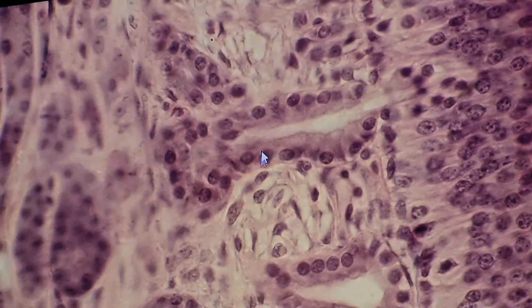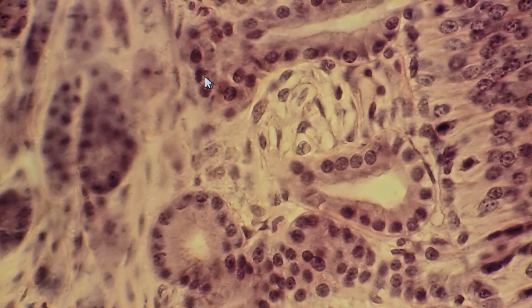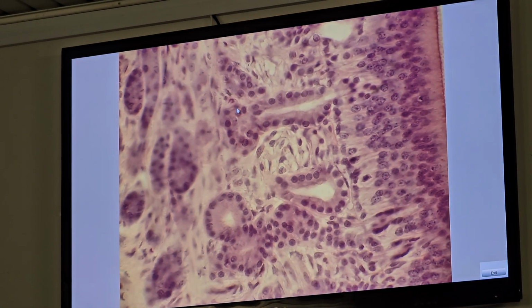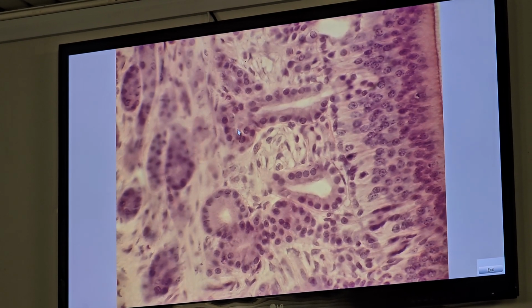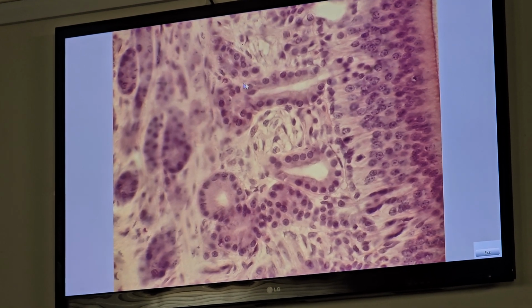Within the lamina propria, we can see large serous glands called olfactory or Bowman glands. These glands produce a fluid surrounding the cilia. Bowman's gland.